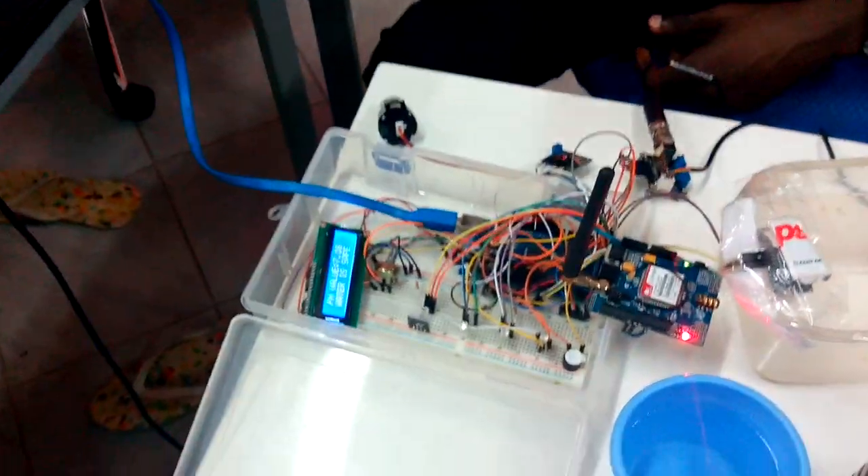Today we are going to do a water quality control system. It is going to check the pH level of the water, the water level, and the turbidity in terms of the cleanliness of the water, as well as the acidity and alkalinity. So what we have here is the complete overview of our system.